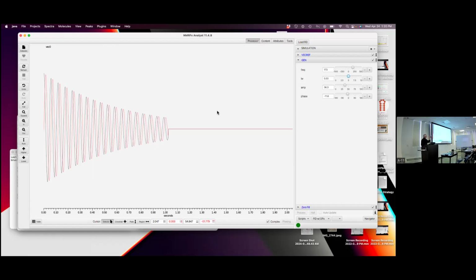That's basically like we convolved that signal with a square wave, a rectangular wave, and the Fourier transform of that is going to give us a bunch of wiggles in our data set. So the next thing that we often do is an apodization, which is some smoothed form of removing the feet. So I'm going to go to common operations and introduce apodize.